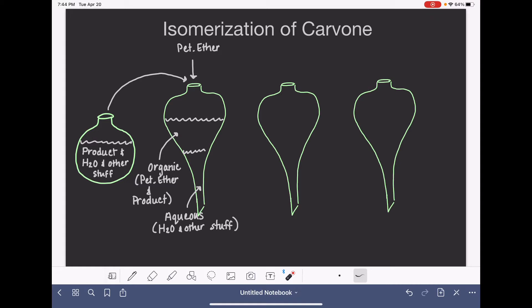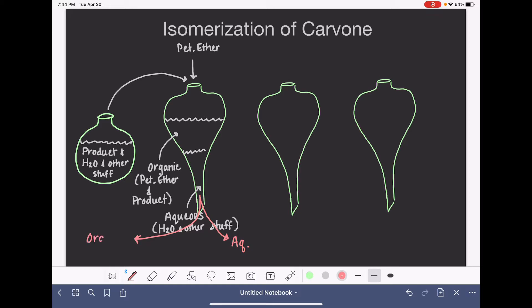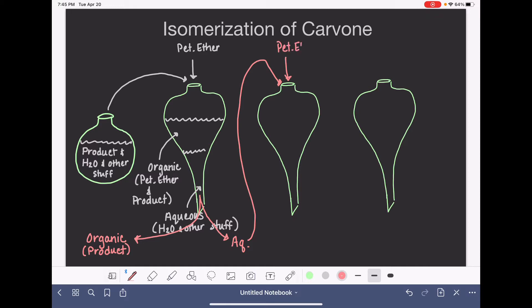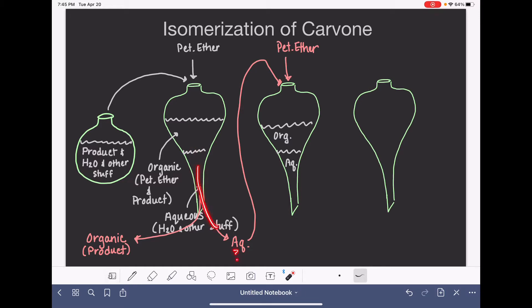Once we've got a good mixture from shaking, we're trying to get the product out of the aqueous layer. Originally the product is in the aqueous layer, but as we shake it up, the product moves into the organic layer because it's more soluble there. After shaking, I'll drain the aqueous layer and set it aside, then drain the organic layer and set that aside — the organic layer is where our product is located. I'm going to take that aqueous layer and put it back into the separatory funnel along with another round of petroleum ether, repeating this process. The reason we do this twice is that maybe not all of the product made its way into the organic layer the first time.